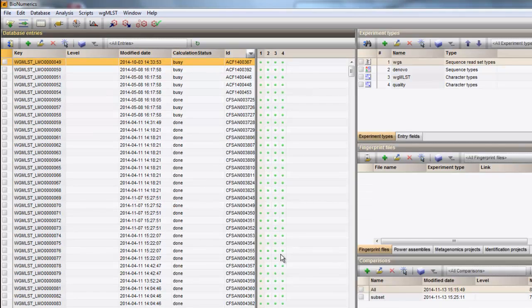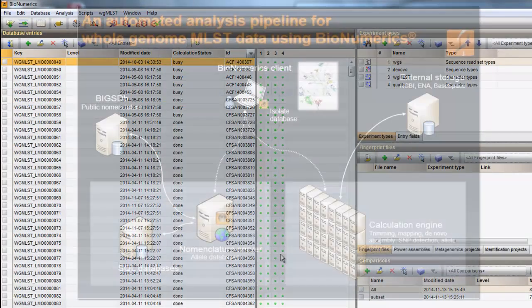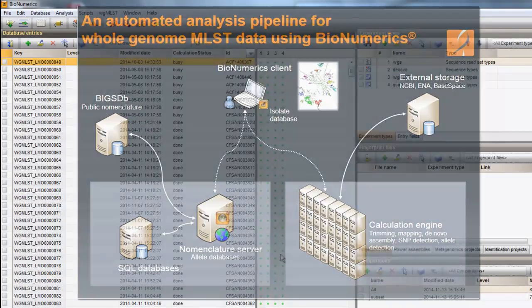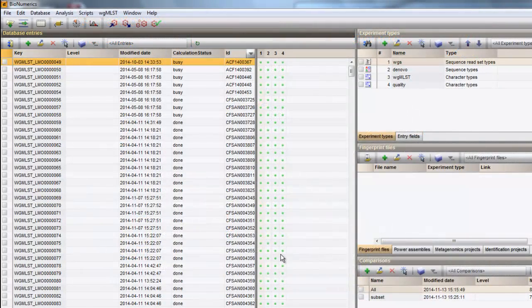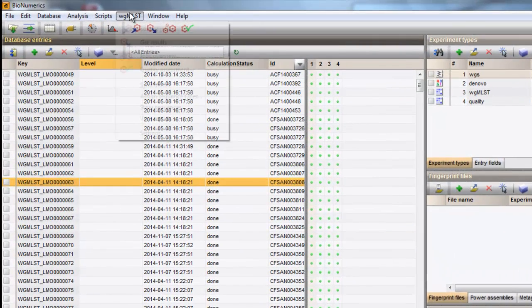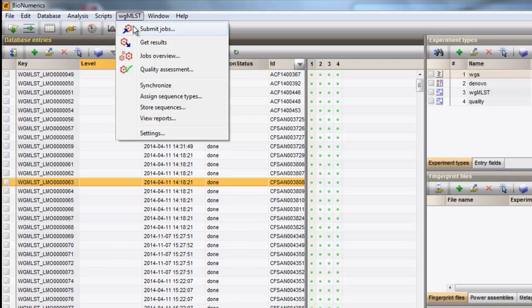In the curated Whole Genome MLST reference allele database, the organism-specific type schemes are defined and need to be synchronized to the sample database upon installation. You can do so by selecting Whole Genome MLST, Synchronize.